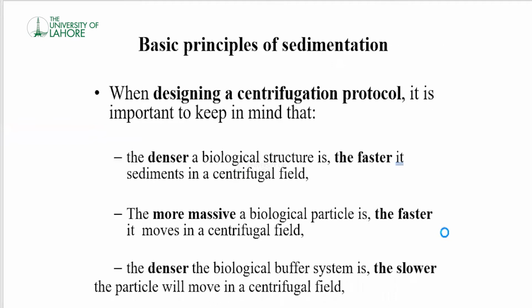Basic principle of sedimentation. When we design a centrifugal protocol, it is important to keep in mind that the denser a biological structure is, the faster it sediments in a centrifugal force. The more massive the biological particle, the faster it moves in a centrifugal force. The denser the biological buffer system is, the slower the particle will move in a centrifugal force.